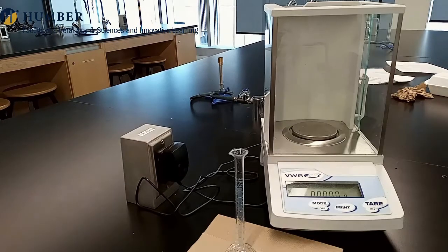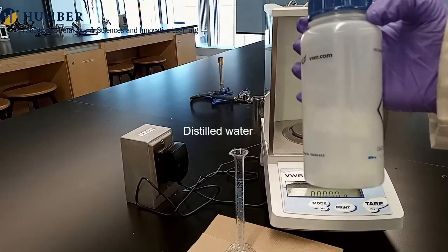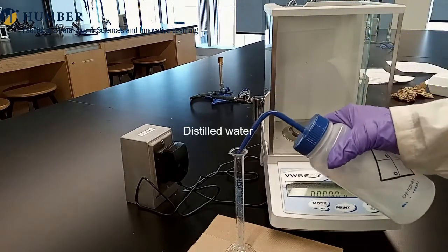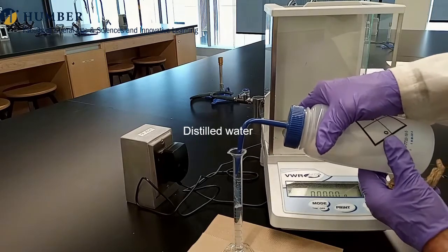The difference in mass, m2 minus m1, will give the mass of sample A. Repeat this procedure for water and sample B.